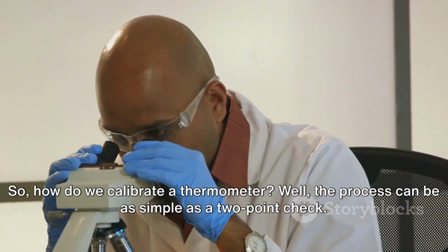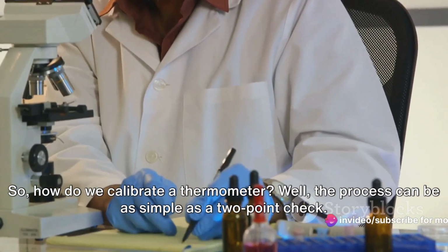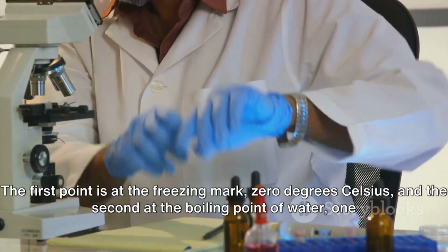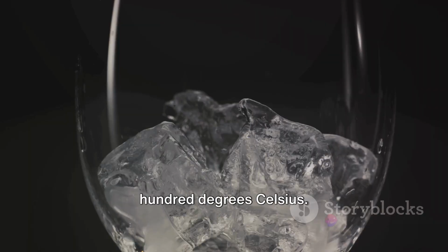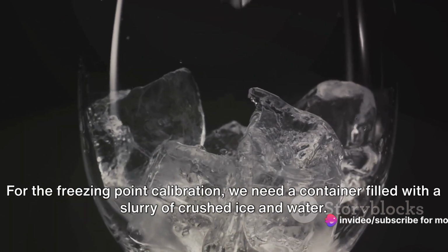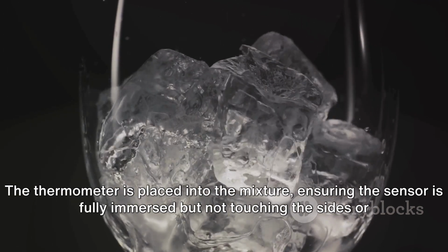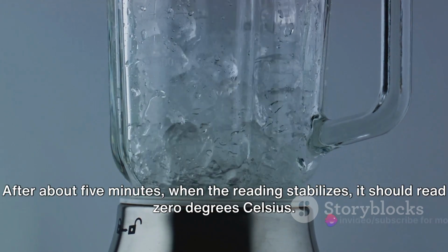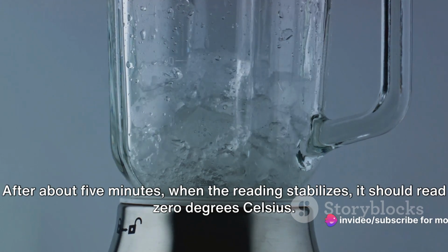So, how do we calibrate a thermometer? Well, the process can be as simple as a two-point check. The first point is at the freezing mark, 0 degrees Celsius, and the second at the boiling point of water, 100 degrees Celsius. For the freezing point calibration, we need a container filled with a slurry of crushed ice and water. The thermometer is placed into the mixture, ensuring the sensor is fully immersed but not touching the sides or bottom of the container. After about 5 minutes, when the reading stabilizes, it should read 0 degrees Celsius.